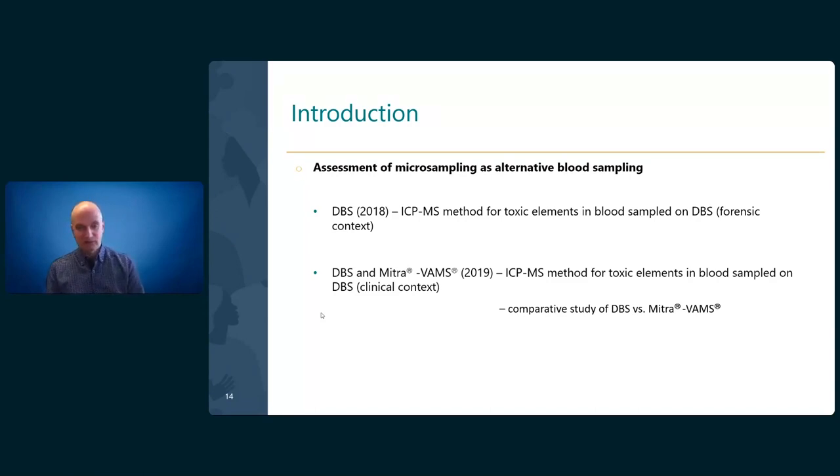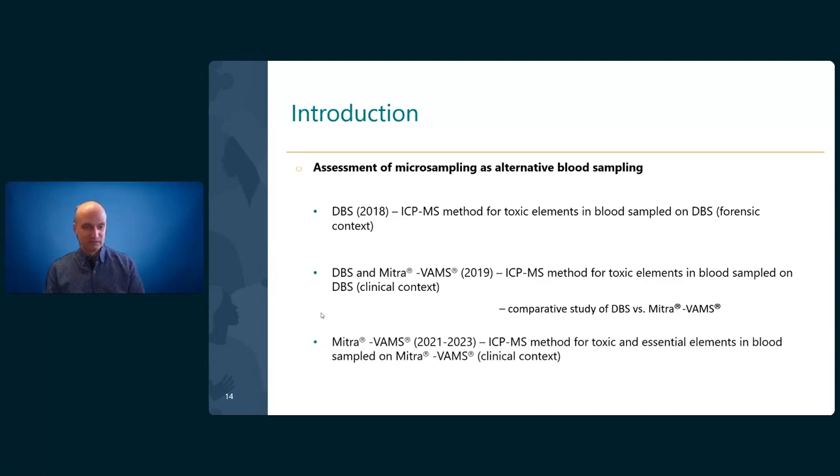And we noticed that it's much more positive and promising. So we then did a comparative study of dry blood spot with VAMS devices. And finally, we adopted VAMS devices for the future developments.